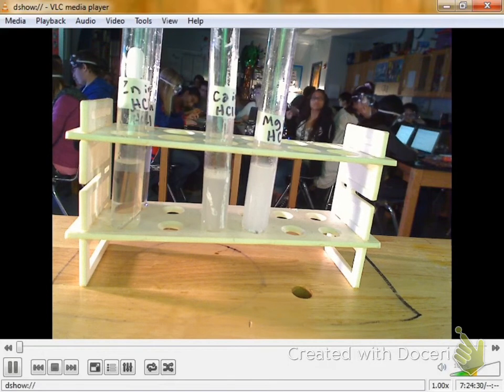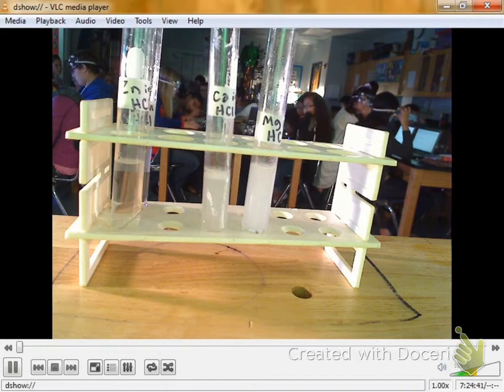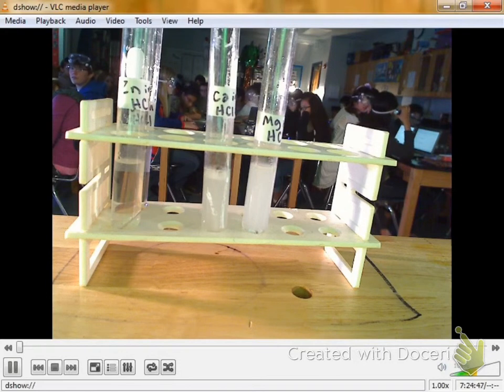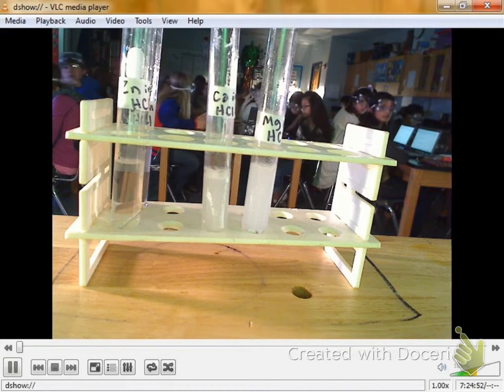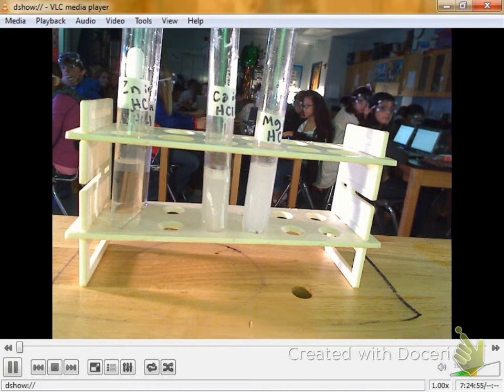Because technically, precipitation is rain, snow, sleet, hail. If I have a precipitate in my solution here, what do you think a precipitate is? It's something that comes out of solution and settles on the bottom. And this is actually making a really nice white precipitate.